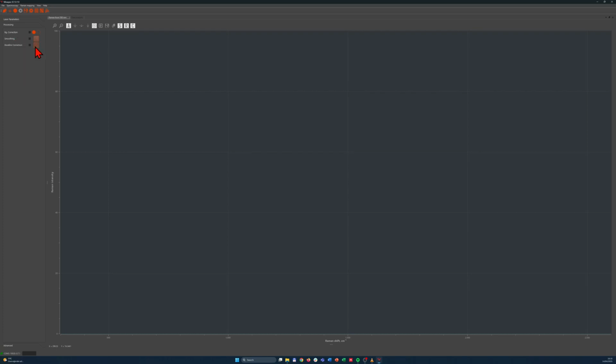Let's close this. Then as well, there are baseline corrections, for example, to correct for fluorescence baseline: Rolling Circle, ARPLS, and rubber band. Advanced settings are available for advanced users, and it's recommended not to change them if you're not experienced enough. It's wave number range, intensity units, percents, or counts, and some advanced settings with respect to stability, reference channel, and transmittance correction, which we don't recommend to touch.